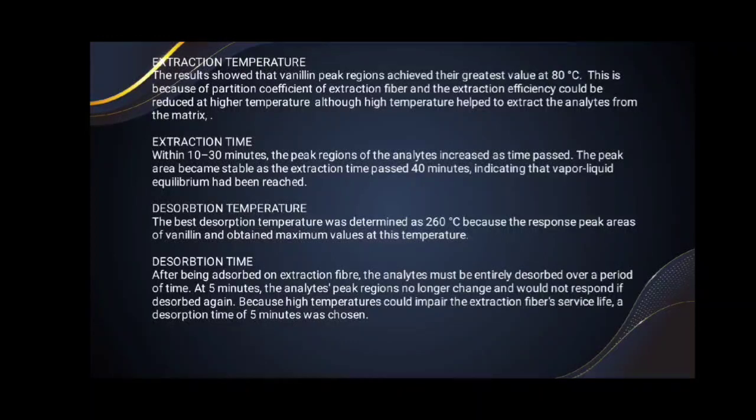Desorption temperature. The best desorption temperature was determined as 260 degrees Celsius because the response peak areas of vanillin and ethyl vanillin obtained maximum values at this temperature.